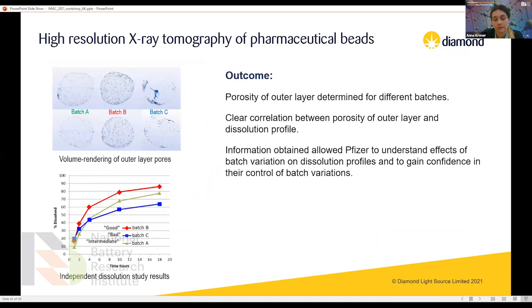This was a very useful experiment and provided lots of information on the product formation. It also helped scientists to find the best way to be more consistent in the formation of the beads, but also to have a bit more control over it.